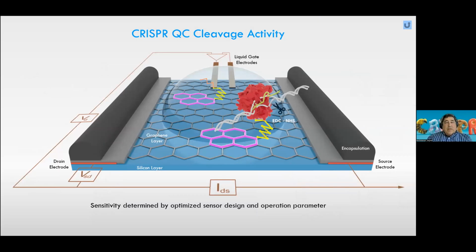Okay, the last one is going to be the cleave assay. It is the longest assay. It is embedded with all the information we just talked about. So when I do a cleave assay, I do immobilize Cas9. I do insert a guide RNA. I do apply an amplicon, which does bind, and so I can see that. And then at the very end, I introduce magnesium chloride, and that allows the cleavage to occur.